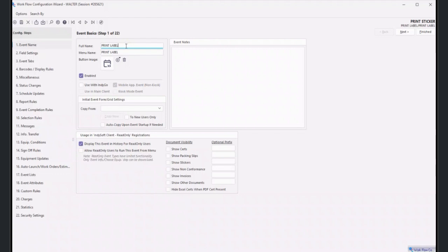It typically defaults to the calibration event. In this case, because I just recently did the planning for this Tip Tuesday yesterday and went into the print label event, it's still remembering that I did that. And so it's showing up.